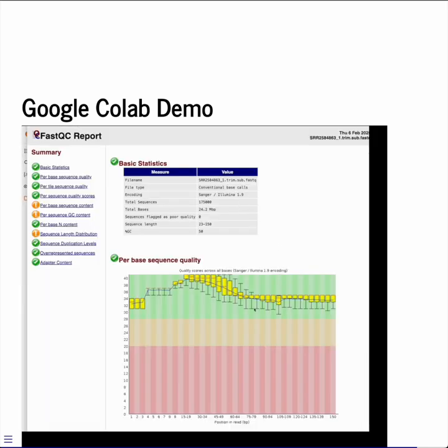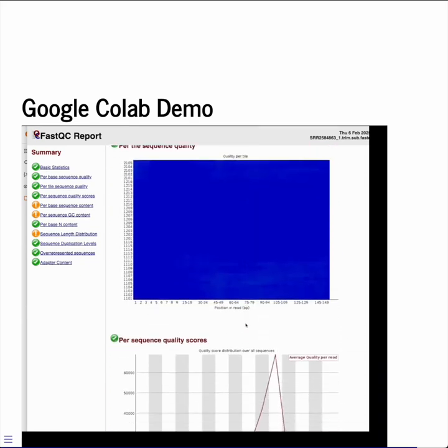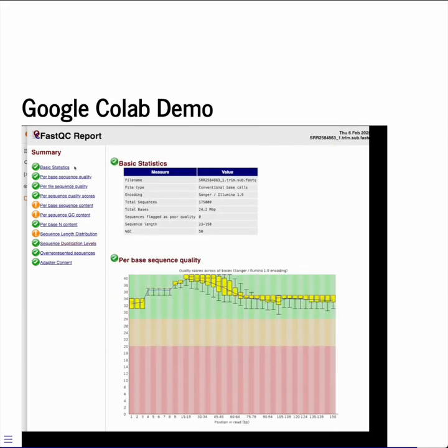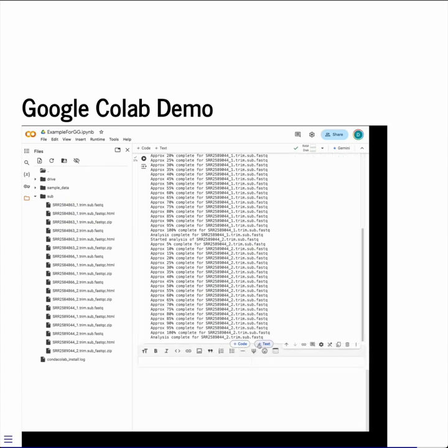There we go, we can see the FastQC output, and you see that the reads are in pretty good shape this time. These are decent reads to do an alignment with. No real issues. A couple of orange items there are just because it's a small file. Okay, so the results are good. So with the result, I'll record that into my document and record also my decision based on that conclusion in this next cell. So it looks good.